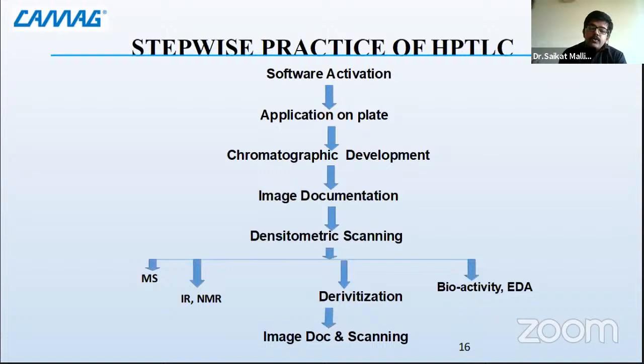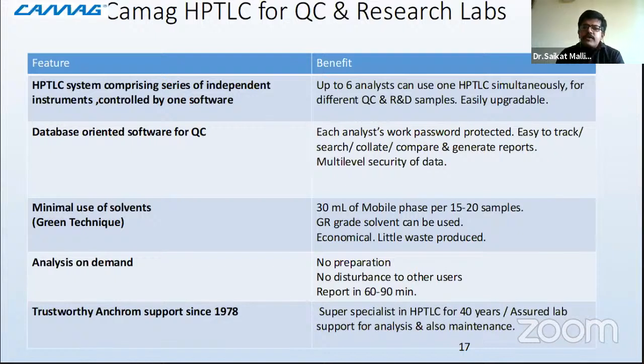And then finally, you can do a bioactivity study also after it. Like as I told you, to check an antioxidant activity, or maybe a DPPH reagent, that is for the antioxidant activity. So like that, this is the general approach of HPTLC. Then some of the points which make it ideal for use in our day-to-day plant discovery kind of activities, I'll not go into these deep, but I have already explained this in my previous slides.